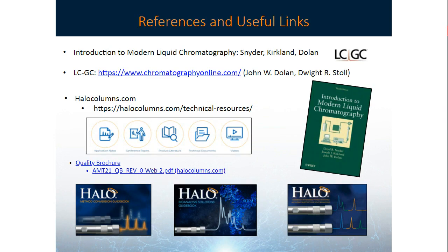So a few references and useful links. I do want to give a shout out to John Dolan and Dwight Stoll. I've read a ton of their articles on the Chromatography Online website, and they have a lot of good troubleshooting articles as well that have helped me throughout the years. A book that I really like to use and reference is Introduction to Modern Liquid Chromatography. A lot of good troubleshooting tips in there.